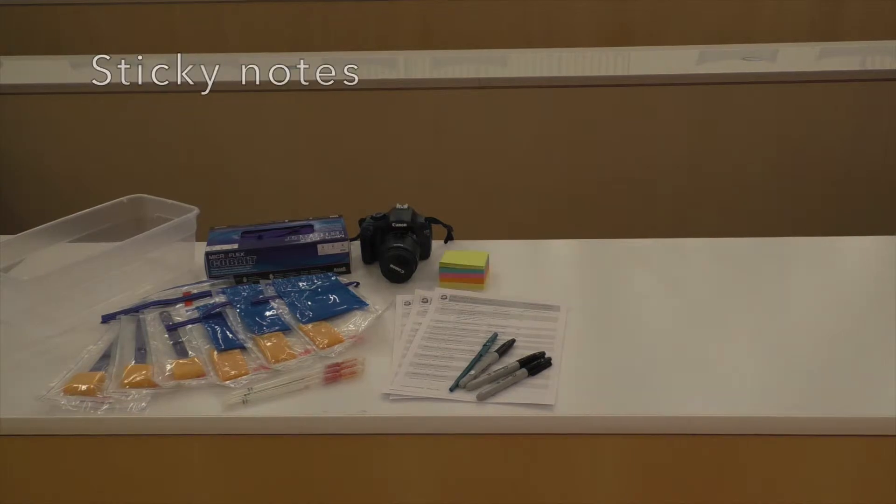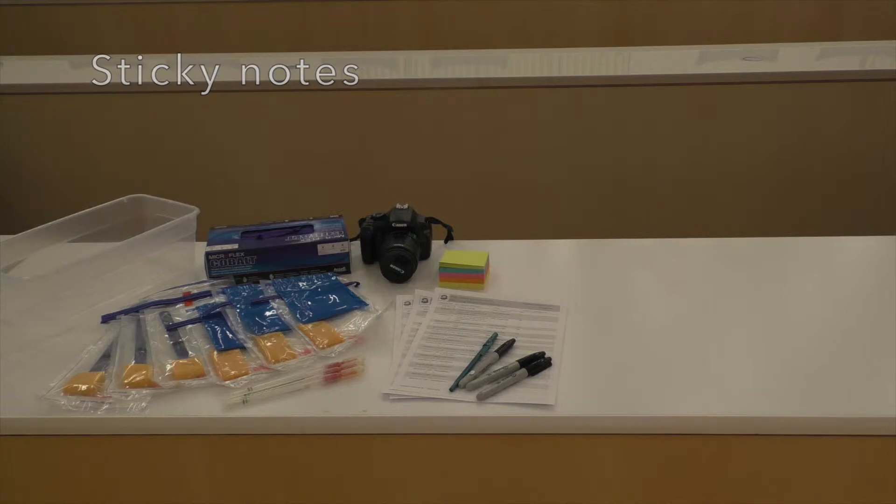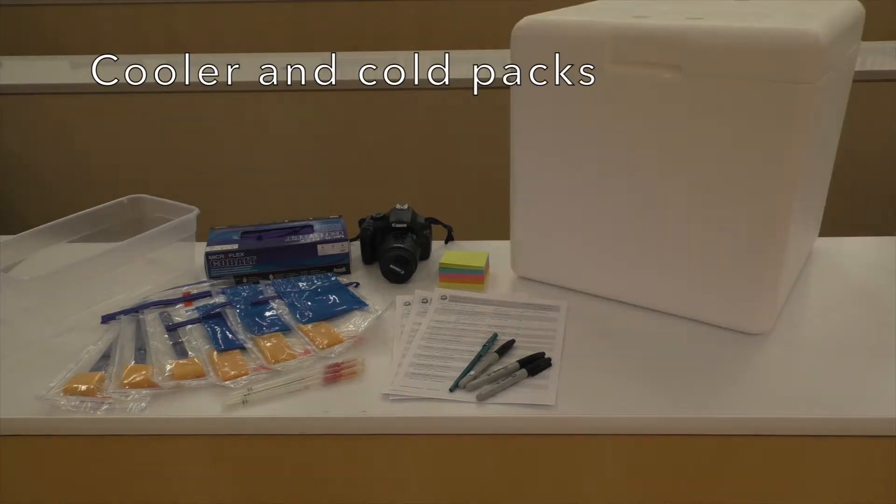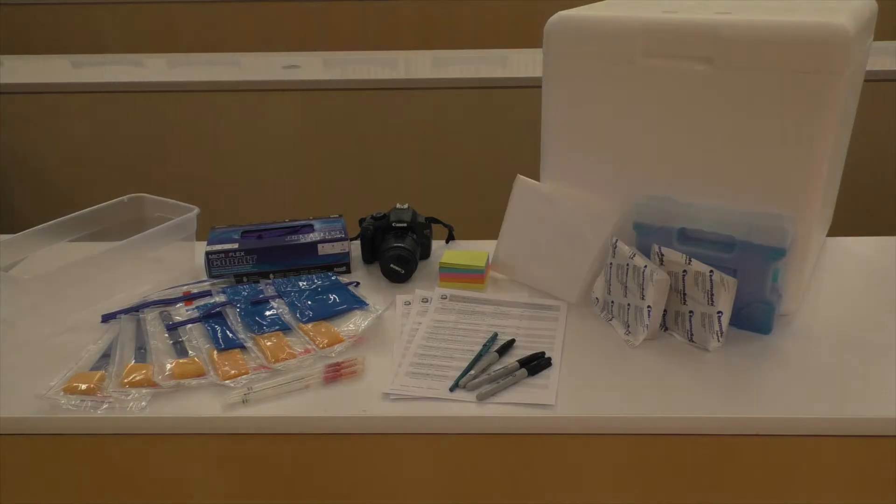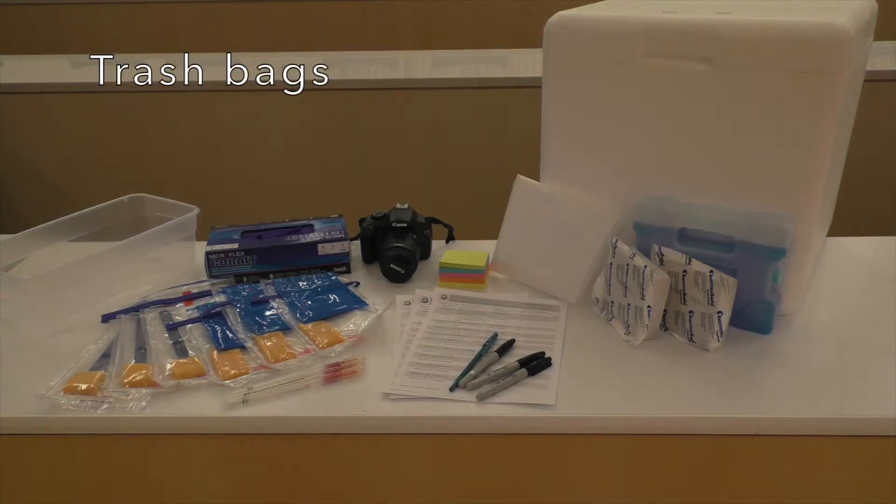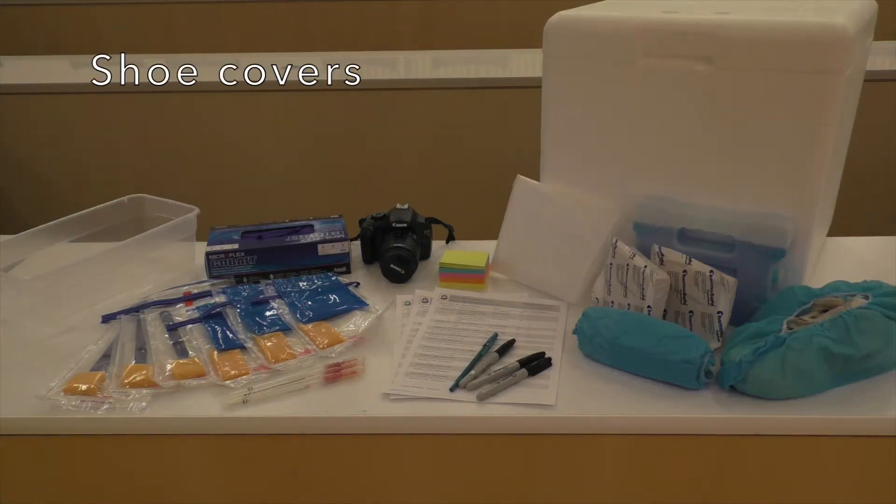Sticky notes to indicate sampling sites and pictures, cooler and cold packs to transport the samples back to the laboratory, trash bags for any trash that you generate, disposable shoe covers which may be necessary depending on the circumstances and the rules of the facility.